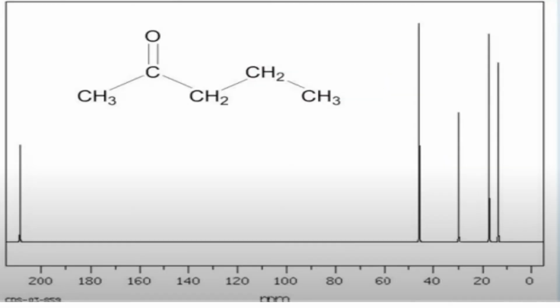The graph we get ends up looking like this. This is not for 3-ethyl 3-methyl pentane. This is for a different molecule, but we end up with a graph that looks something like this. All you are doing in this graph is looking for how many peaks there are. In this graph, there are 1, 2, 3, 4, 5 peaks. That means I should expect to see 5 carbon environments, and in fact I do.